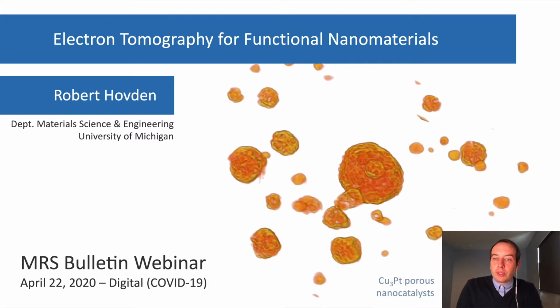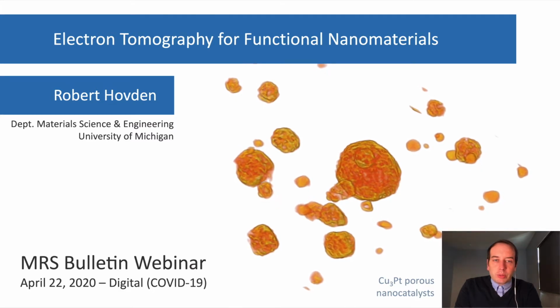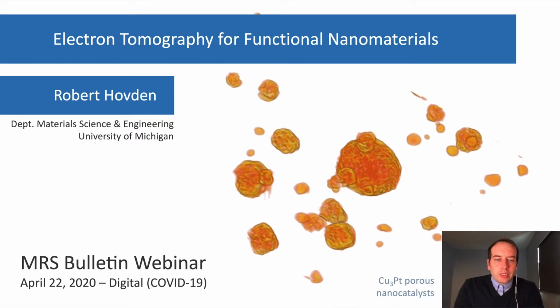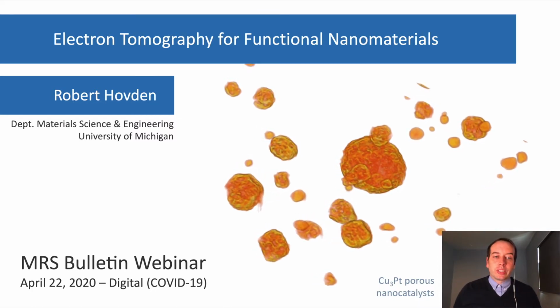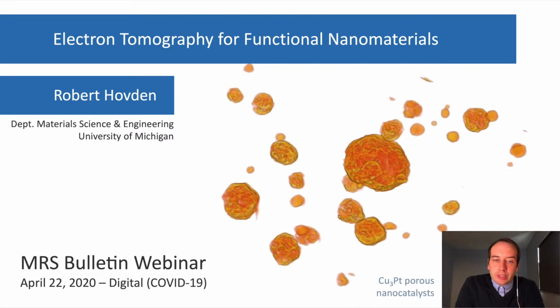Okay, thank you. Thank you, MRS, for hosting these wonderful seminars as we cope with the pandemic lockdown. I think it's a great thing. The goal of this talk is to highlight the maturing field of electron tomography and its widening scientific applications that are utilizing 3D structure, chemical, and functional imaging at nanometer and subnanometer length scales.